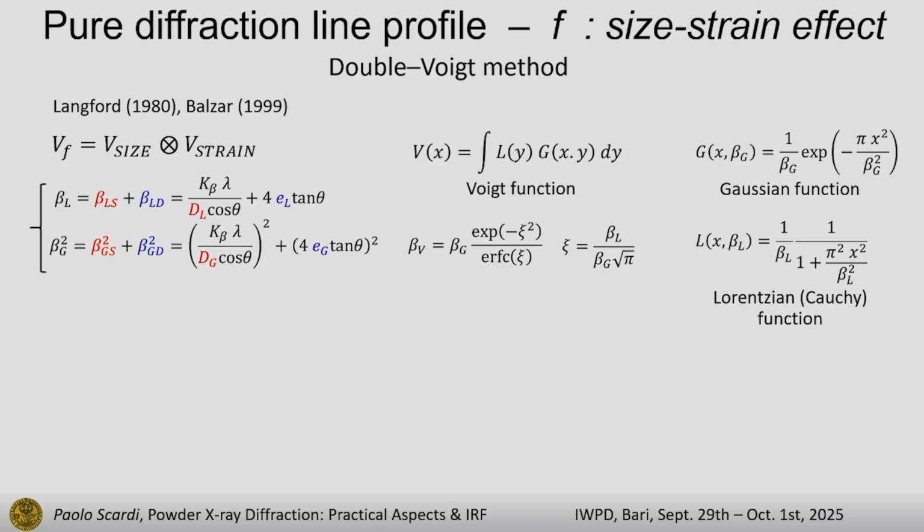The next step is you use the equation from Scherrer and the other one, linearly combined with the Lorentzian component and the Gaussian component. It is nice, it often fits your data, but the meaning is not very clear. I mean, you have seen that the meaning of the sizes is not at all a simple one.